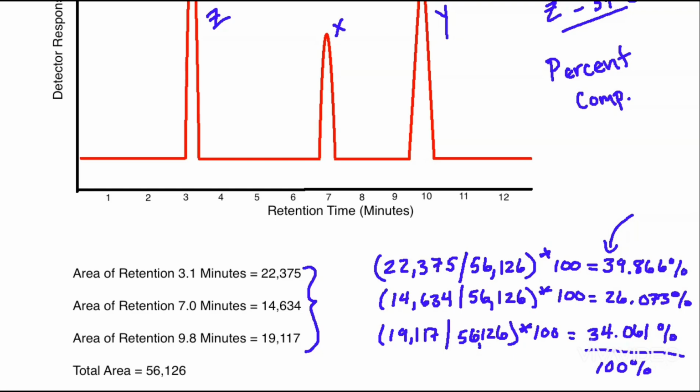And in your discussion section, you would want to discuss that the GC is confirming that it's the most prevalent product, and here are the reasons why you think that might be the case. So it might be sterics, it might be hyperconjugation and stability, so some sort of stable lower energy conformer. Okay, there's lots of different reasons that there might be. However, that's for you to decide. This can simply show you which one is going to be the most predominant product.